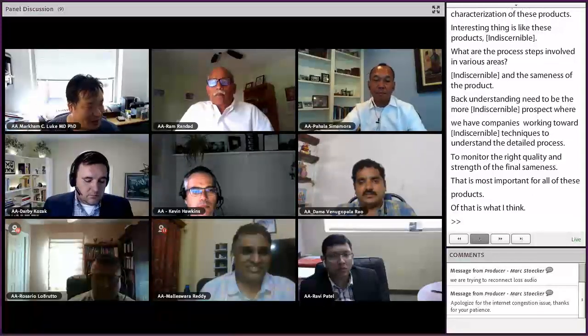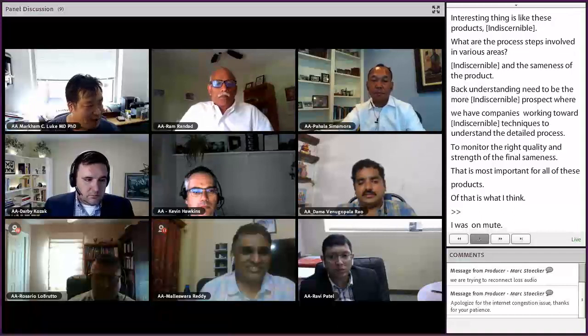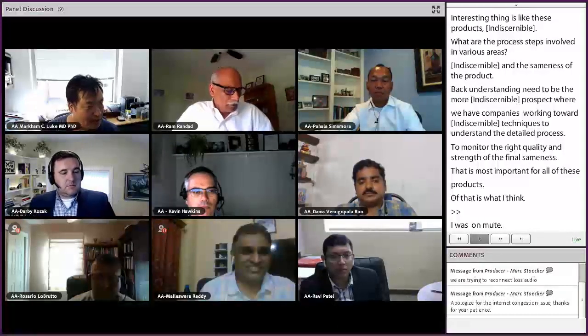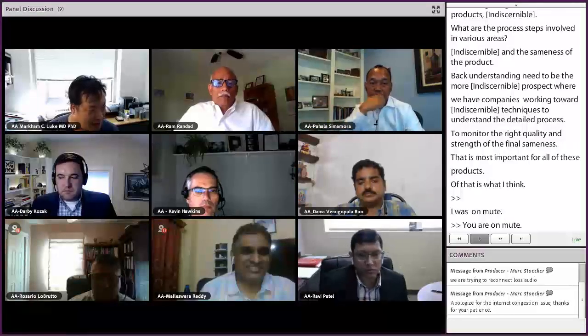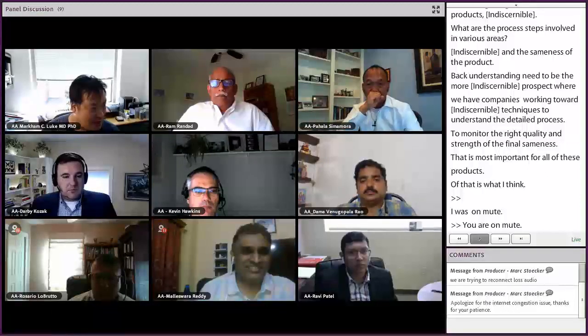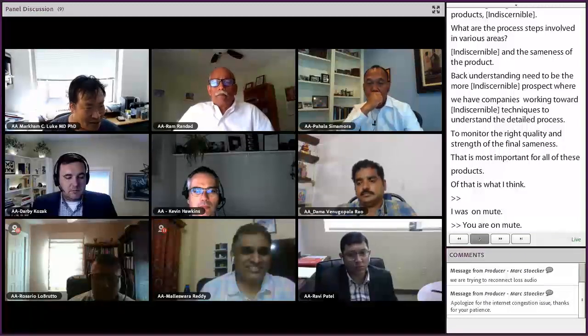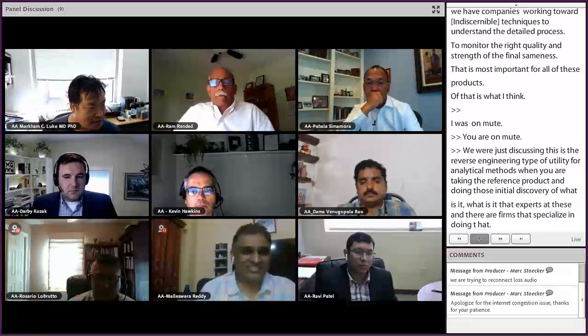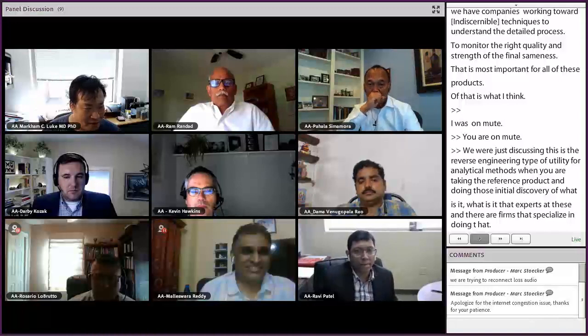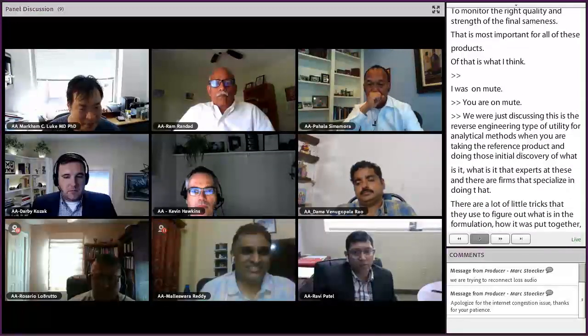We were just discussing that this is the reverse engineering type of utility for analytical methods, when you're taking the reference product and doing those initial discovery steps of what it is made of. They're experts at these, and there are actually firms that just specialize in doing that. There are a lot of little tricks that they use to figure out what's in the formulation, how it was put together, etc. Yes. Some of those are proprietary methods, I imagine. Yes, you are right, Malcolm.